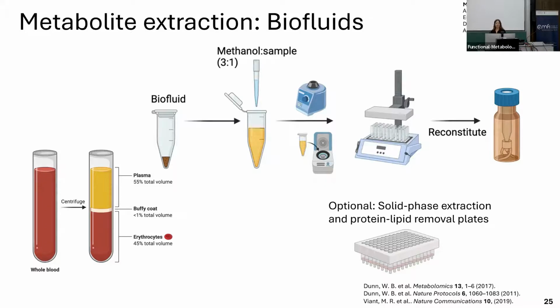So then of course they shake the sample, they centrifuge it, and they dry it using gentle nitrogen stream, which I highly recommend if you're drying small samples. If you dry like liters, then of course use a rotary evaporator. And then redissolving and moving everything into an HPLC MS vial.